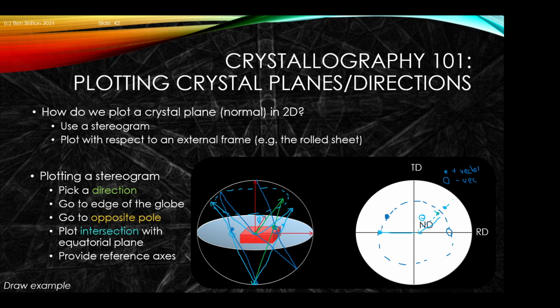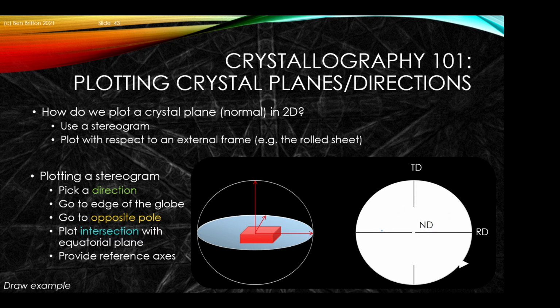And so by that, apologies, if I just go to the next slide to give you an idea. So if I then take effectively some point that's present here, how would I find that? So I could draw this point in 3D. I would then go from the hemisphere pole back to the center, and so that is the vector that that stereographic point matches to.